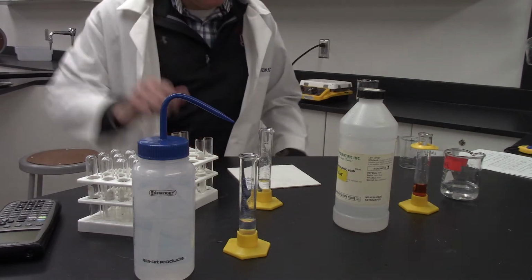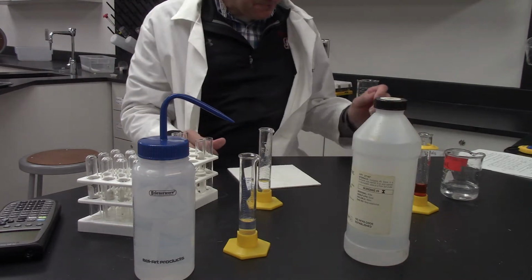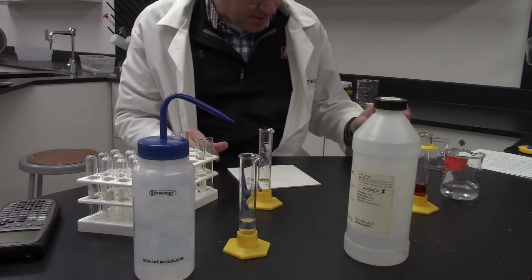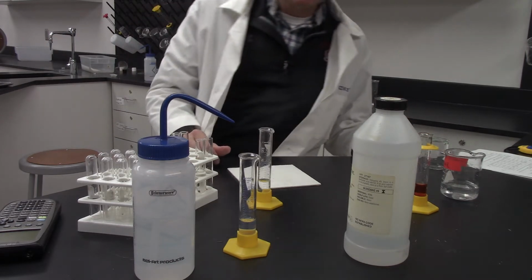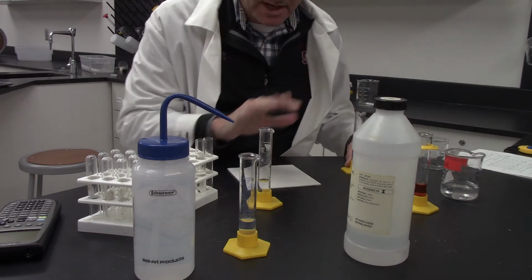Hi kids. So here's the lab that we've got, this reaction with iodine. We have four things we're going to mix together. Now I'm actually going to do reaction number 2 because that one goes faster than reaction number 1.